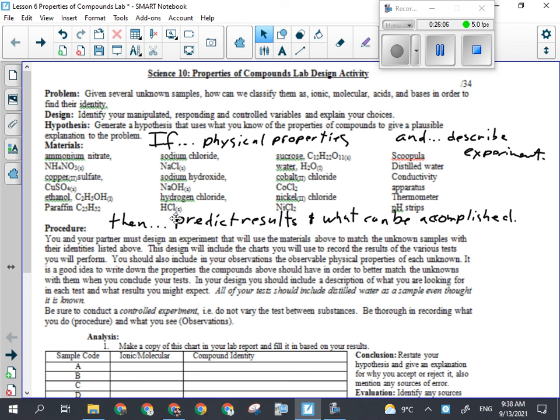What you're going to do is have the thermometer in as you add the water, because what are we looking for? We're looking for temperature changes. So the thermometer has to be in there the moment the water is added. So you add the water with the thermometer in place. And how much water were we supposed to add? I would say fill it to 3/4 of the way full. I wouldn't go much more than that for risk of spilling.